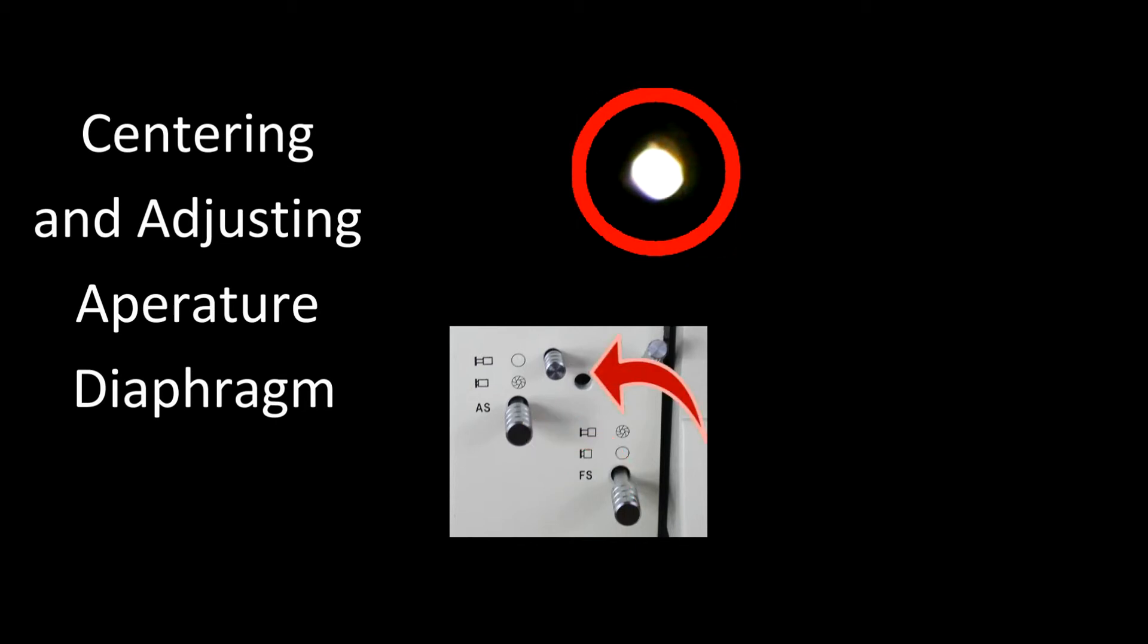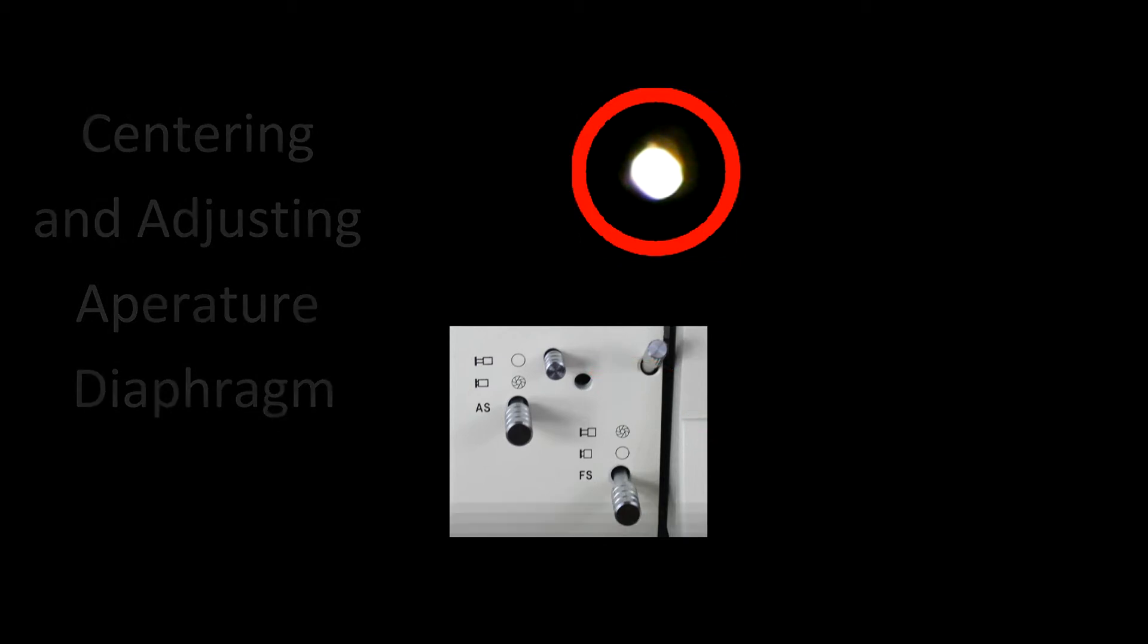And if you need to make an adjustment to align it, there's two set screws on the side of the lamp housing, one on each side. And by adjusting that, we can center the diaphragm.